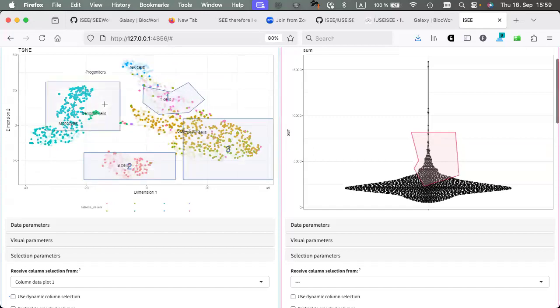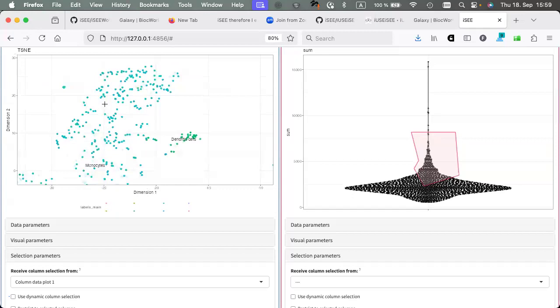What we did is that, even if it's not a plotly based plot, this is just pure ggplot, there is a JavaScript powered tiny little tooltip that can already tell you something more about what cell that was, or what gene that was if we're talking sample assay plot.